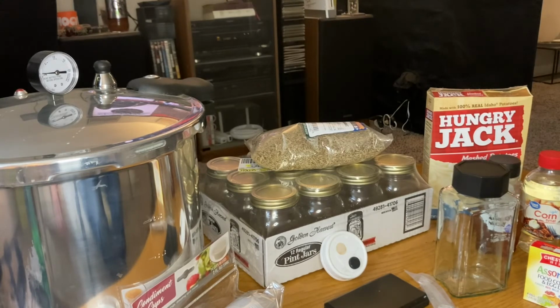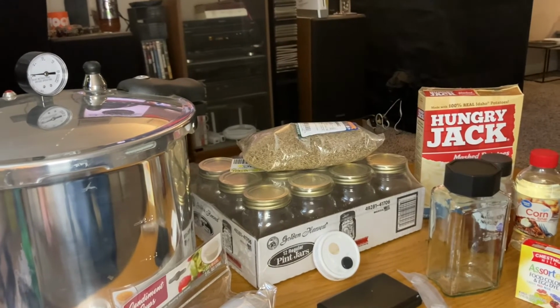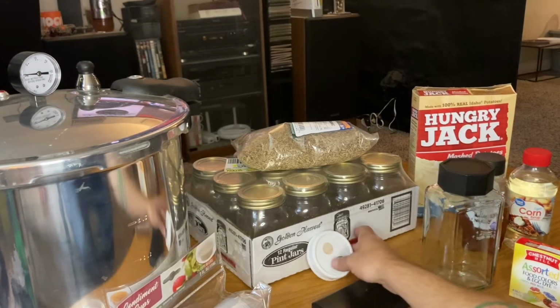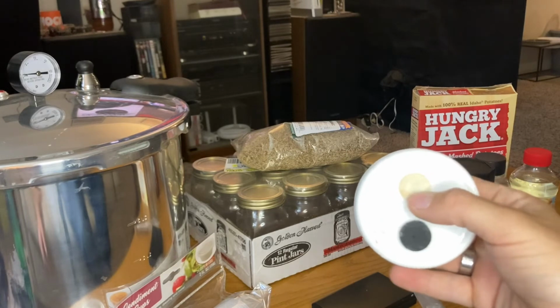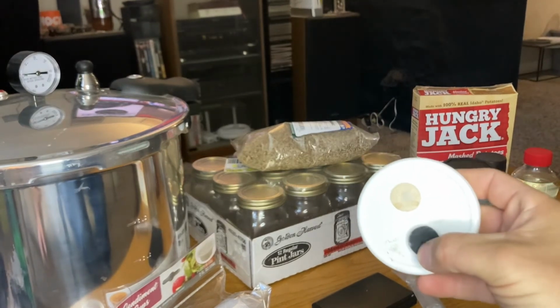So basically, you'll definitely want a pressure cooker, some mason jars, some whole rye from Natural Grocers, potato flakes, some kind of glass dispensing dish for your agar dishes, some honey or corn syrup or both, some food coloring, and this is what your little stickers will look like. You can find them on Amazon. And then that's a self-healing injection port.